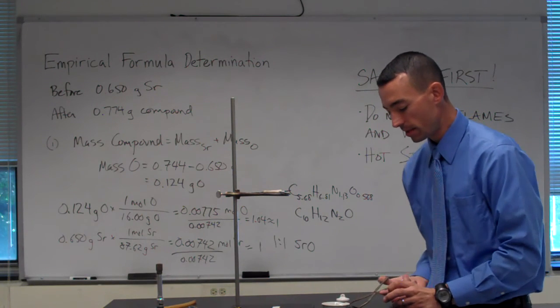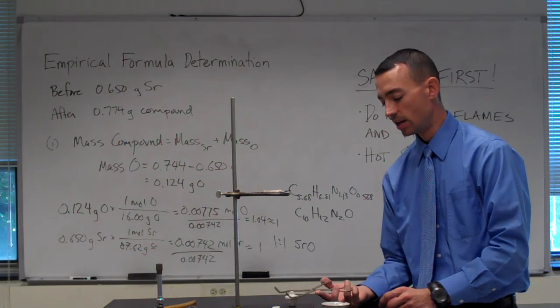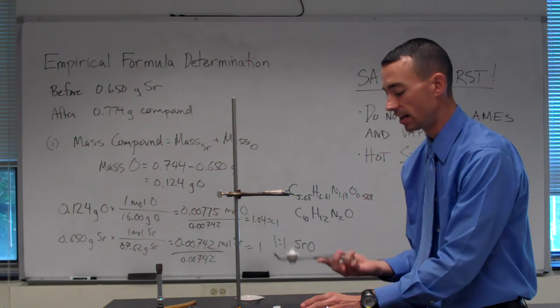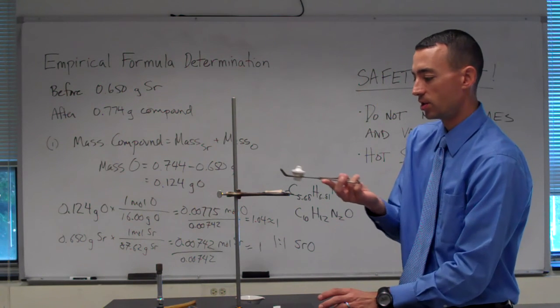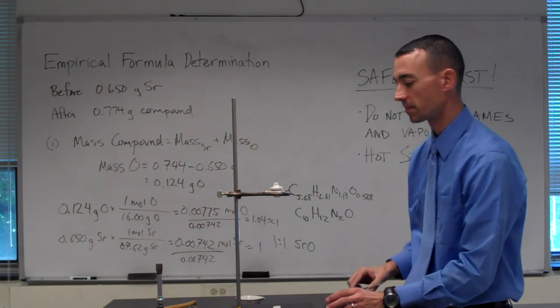So I would really recommend you practice. Try to get my hand nice and low. You can even set the crucible up on the base of your ring stand, and that allows your hand to get in underneath there. The key is to really not squeeze too tightly, just to gently rest it in the shape of the arms of the crucible tongs.